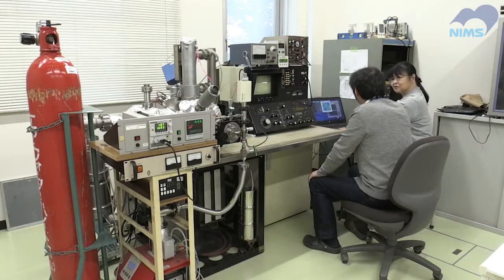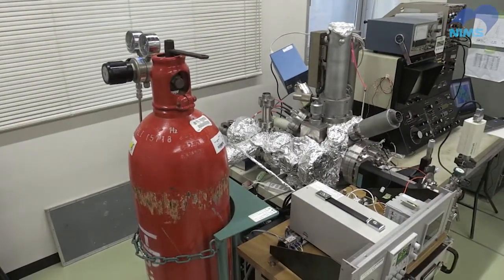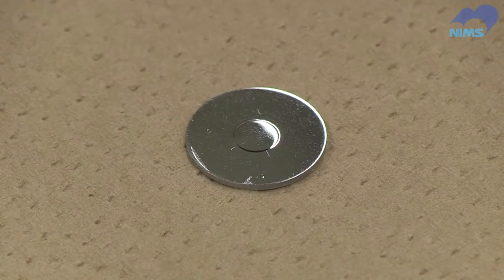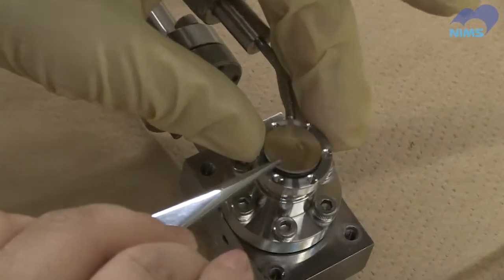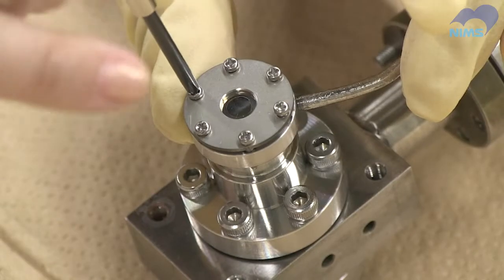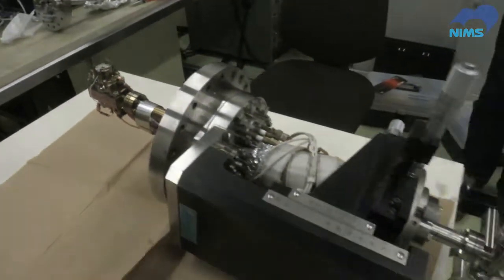The first improvement. Hydrogen gas permeating a metal can be observed while applying the gas to the metal. A sample of a metal of interest is placed in the special holder. Hydrogen gas is supplied at the back of the sample to be observed. The holder is mounted in the microscope.